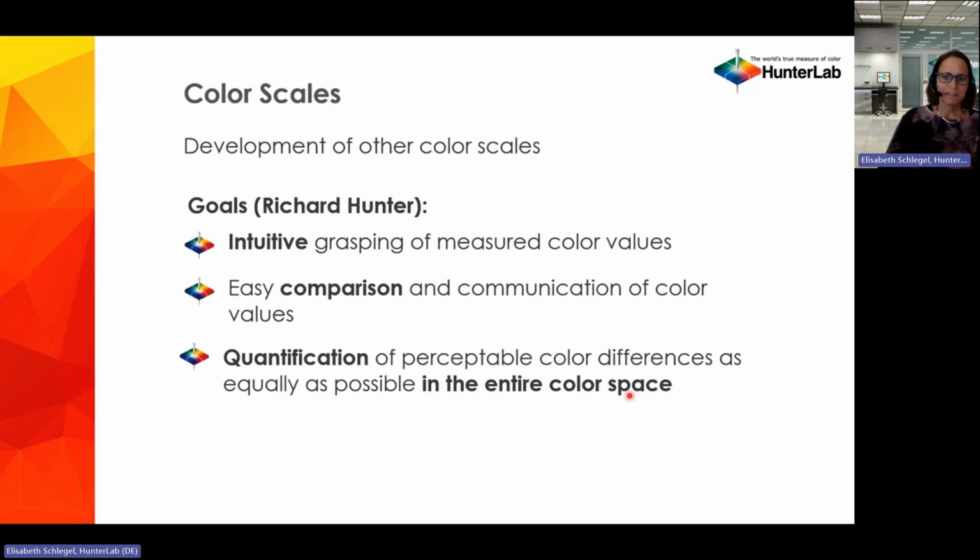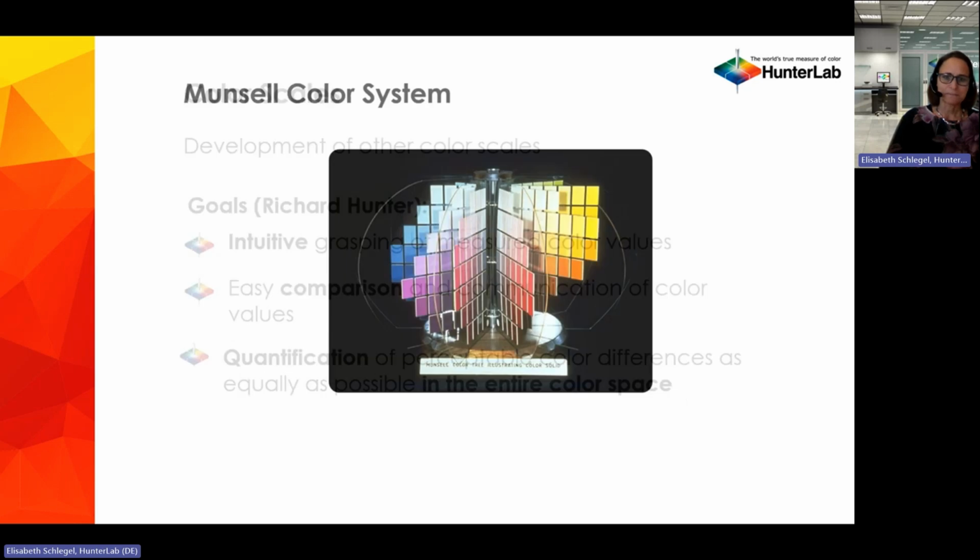And you see here, we are already talking about a color space and not a unique scale. For example, length we can measure by a single number in meters. But just one scale wouldn't suffice because we can, for example, find a number for red and for blue, but then we have certain other directions we have to take into account.